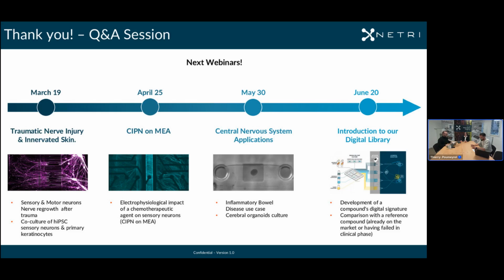Like they will do in a dish, they are really growing the extension really fast compared to all the cell types that we've been cultivating in our devices. Those are just going for it, like they will reproduce in the body, but they don't need target cells to project. Target cells increase even their rate of projection, and they make it even faster, but it's not required.